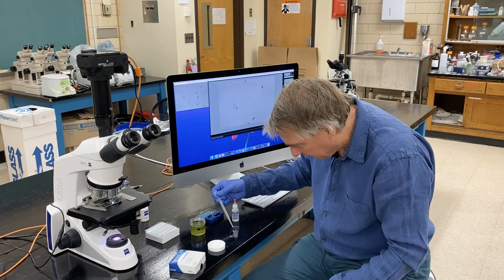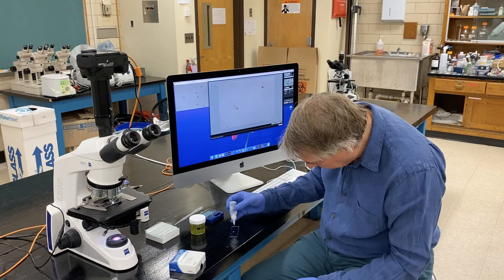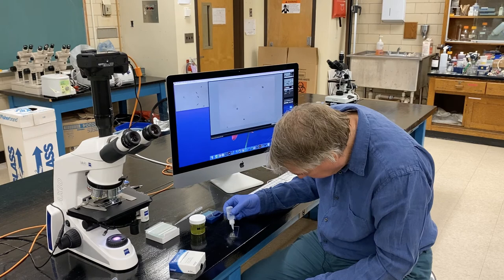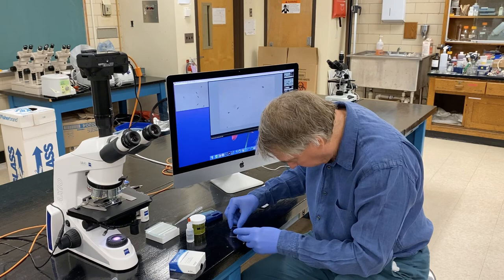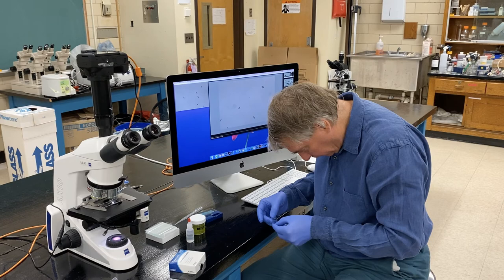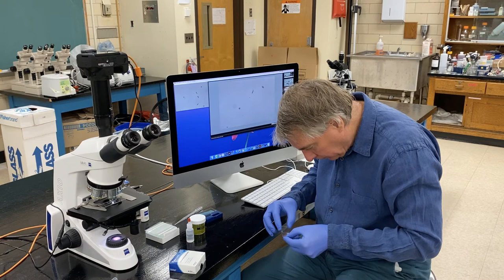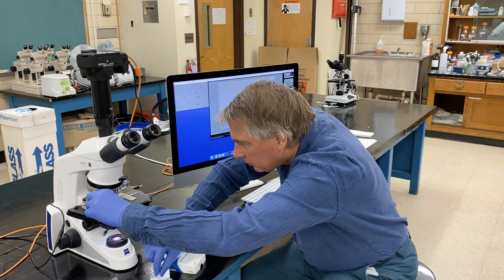So I'm going to add one drop of Euglena. And I'll add one drop of Protoslo, which has a nice little squirt bottle. And let's see what the effect of that is. So we'll pull this slide off, and put one in that has Protoslo on it.